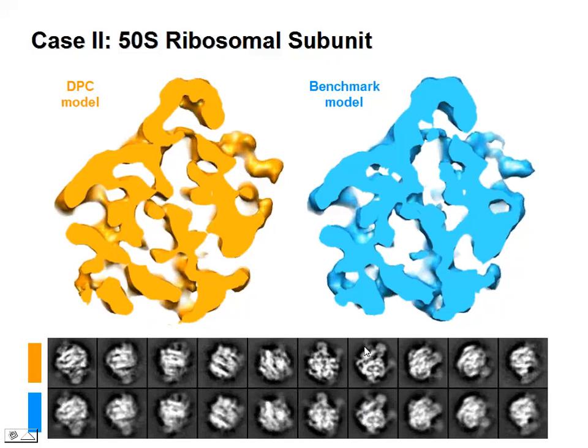So in this case, you picked 75%, and that's obviously a threshold that you can move up and down. The threshold is basically, I would recommend 0.5. The completeness score is from 0 to 1. Right, and just empirically, through testing on several data sets, 0.5 is a good number.